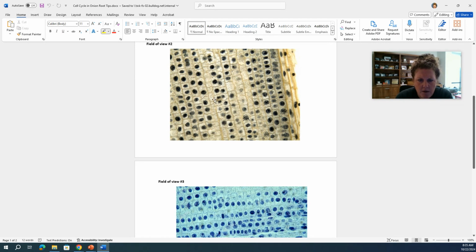Over here, like this one here, this would actually be two cells in interphase because these are two cells that were recently made. You can see that they're smaller than the rest, but that line goes all the way across. So that would be your new cell wall. And so if you're trying to distinguish, is it a telophase or are they back in interphase, look to see if that cell wall is complete, okay?